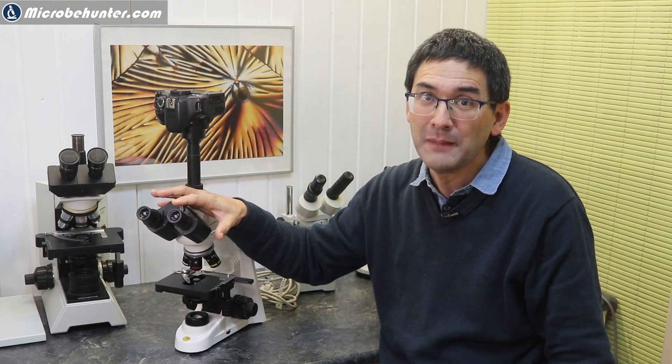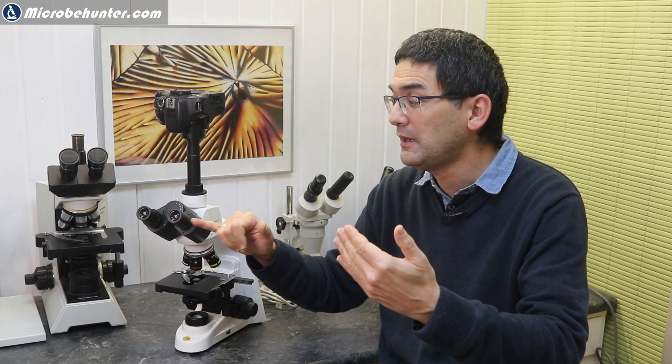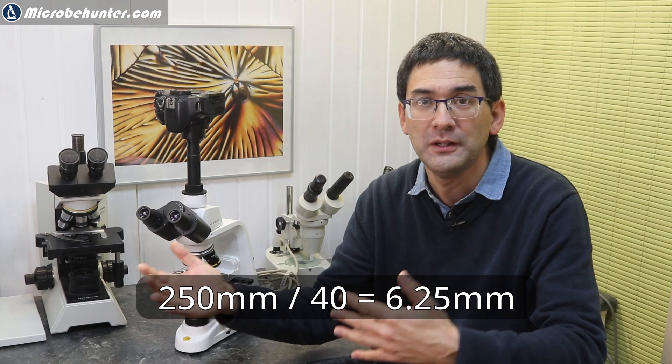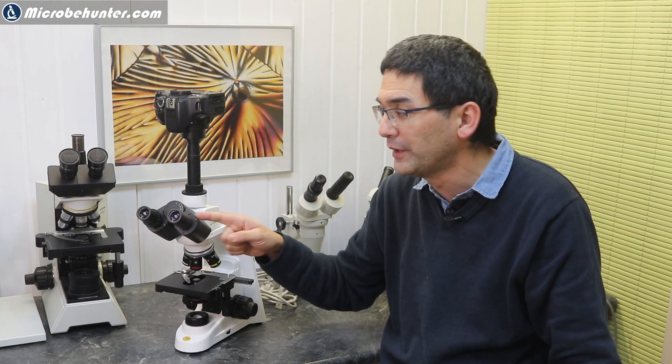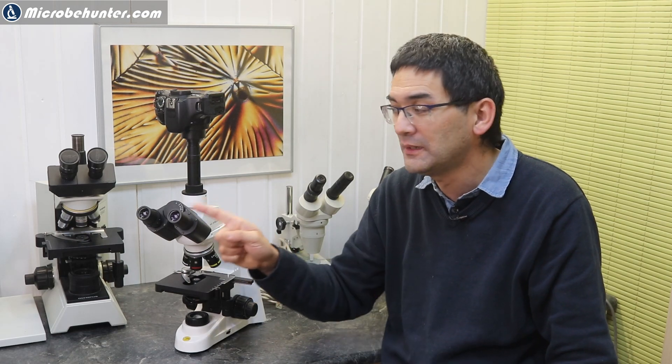The camera itself does not have a magnification. I need to explain this a little bit. When we look at visual magnification and it has a 40 times magnification, this means that the image I see when looking through the microscope will look 40 times larger from a viewing distance of 250 millimeters. This was standardized some time ago - I think in the 19th century the viewing distance was standardized to be 250 millimeters. A 40 times magnification means I will see the image as if it were 40 times closer to my eye. You do the math: 250 divided by 40 gives you 6.25 millimeters. With a hundred times magnification, the object would be 2.5 millimeters in front of my eye, and this is the size I would then see through the microscope.